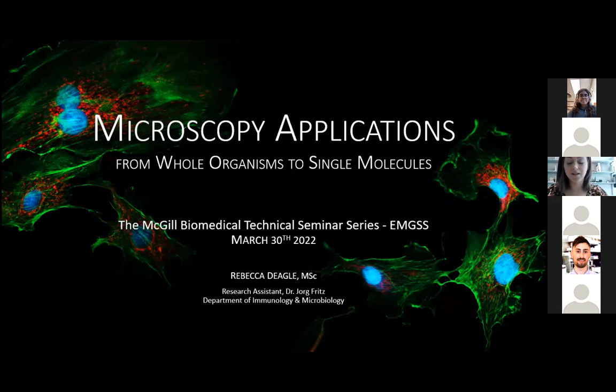Like Aitan said, during my time at the Advanced Bioimaging Facility, I was a microscope specialist, and I was meeting with researchers just like you. I would be discussing with them what their project was, what they wanted to see, what they were hoping to find, and based on that information, we would discuss what kind of fluorescent probes they needed to use, as well as what type of microscopy application would be best suited for their research question. Then I would train them how to use those systems and then how to do the analysis after the fact.